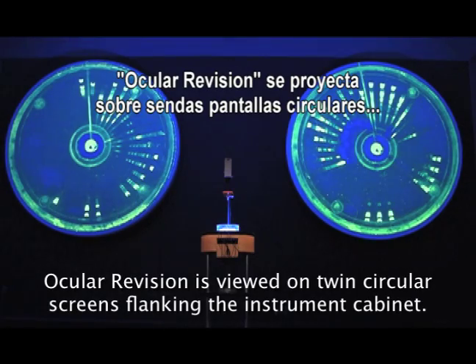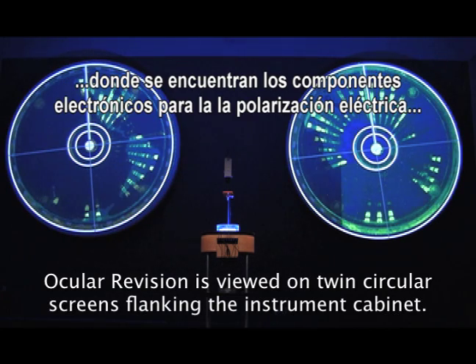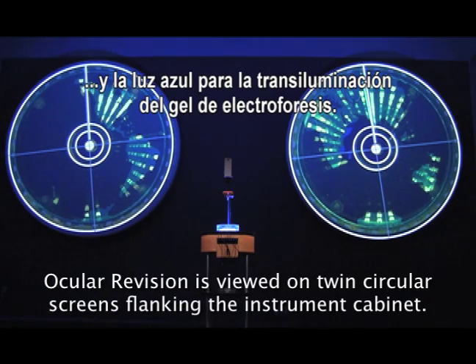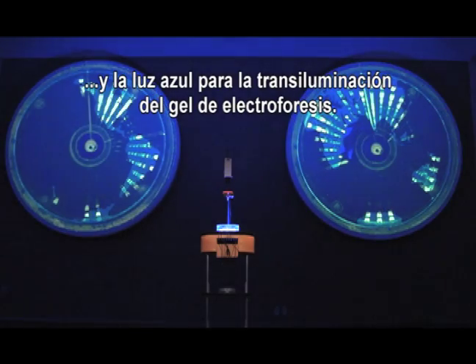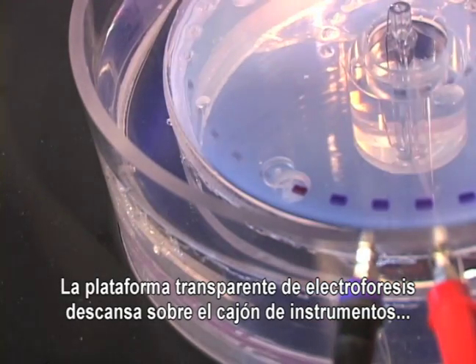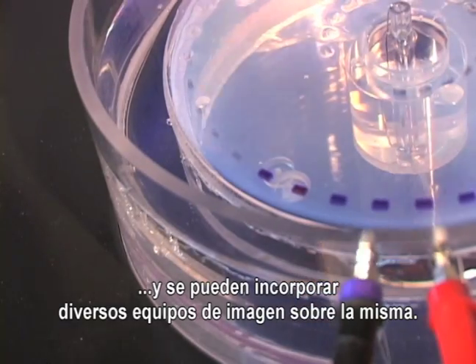Ocular Revision is visualized upon twin circular projection screens flanking the instrument cabinet, which houses electronic components for electrically polarizing and blue light transilluminating the electrophoresis gel. The clear acrylic electrophoresis rig rests atop the instrument cabinet, and varied imaging equipment can be attached above it.